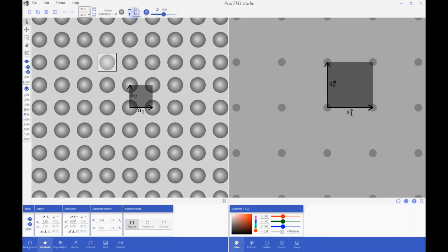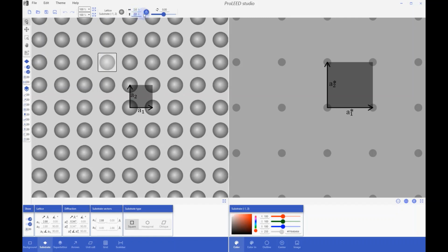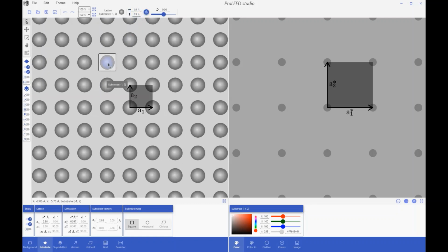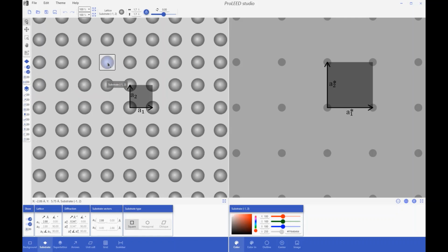Lattice point sizes are changed using the top toolbar properties. By default, the ratio is locked, and when you change its width, the height is automatically updated. It can be unlocked by the buttons next to it. The mouse wheel is generally used for changing the selected object sizes, and it's very helpful. The last step for the lattice point is the center tab, where you can change the shadowing effect.